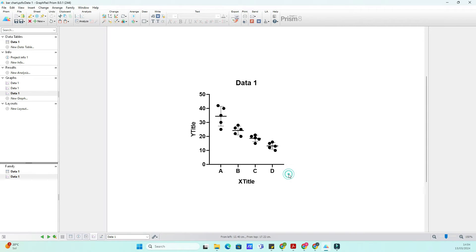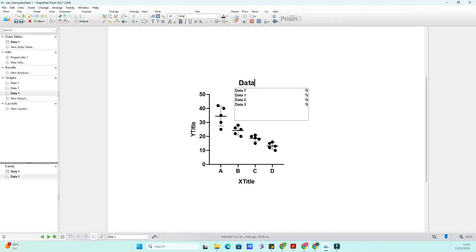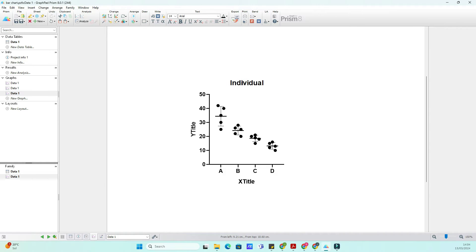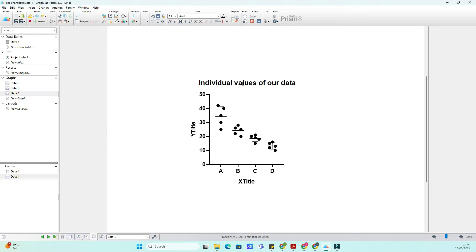So let's dive in. First things first, let's fire up GraphPad and get started. Once you've entered your data into GraphPad, navigate to the Inserts tab. Now, select Insert Graph of Existing Data.